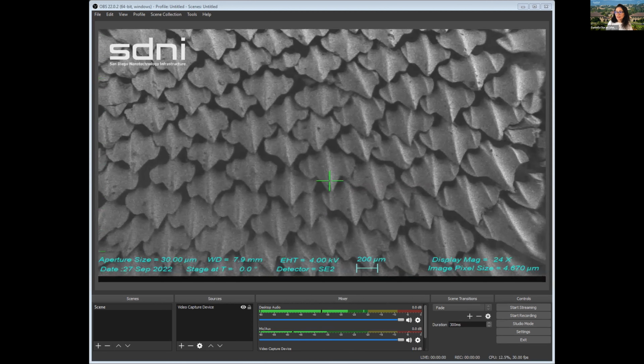It says, are you able to cut into a sample to see inside? What is inside the pollen granule? Ooh, that's a good question. We definitely can cut it, and we have not done that before. So that would be interesting. Like, yeah, I kind of wonder too, is it hollow or is it solid?